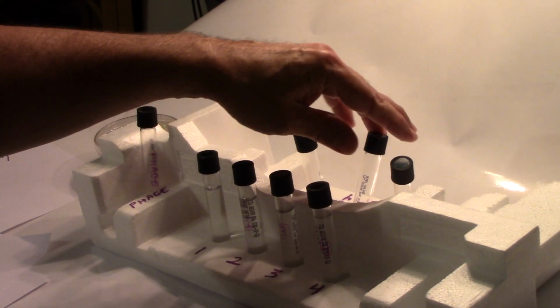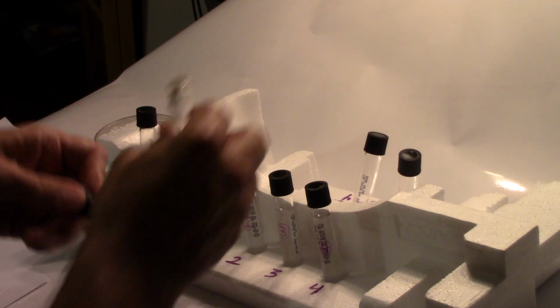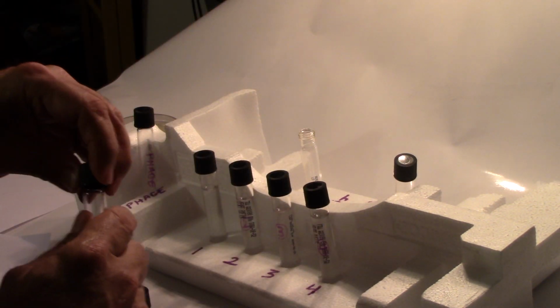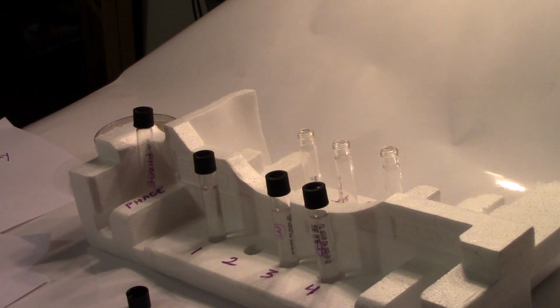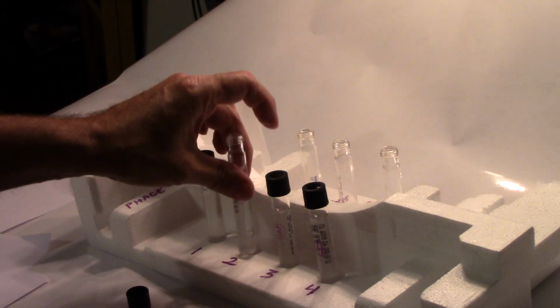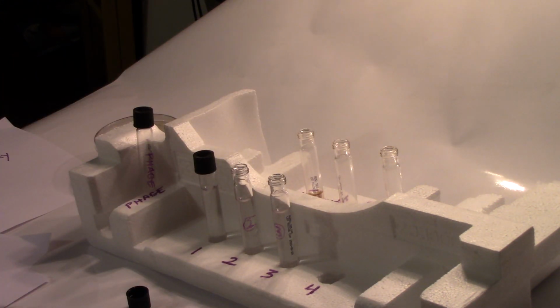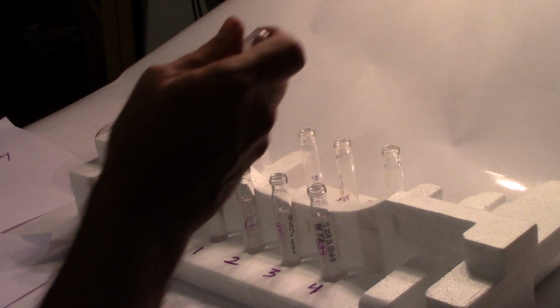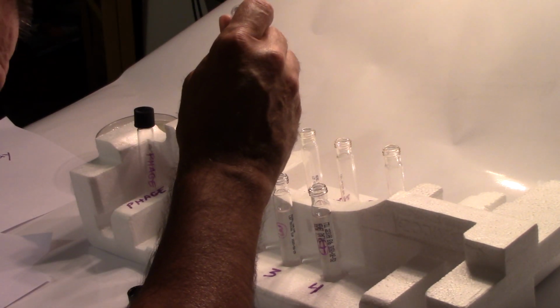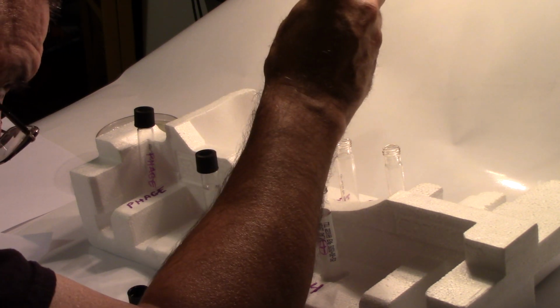Now, for tubes 2, 3, and 4, I have soft agar with bacteria in it. I'm going to open these up for number 2, number 3, number 4. And I'm going to go in with the pipette. 2, 3, 4. Each time I'll use a new pipette, and I'm going to add an equal amount. I'm going to add 200 microliters. As long as it's a standard amount, it's going to be fine.